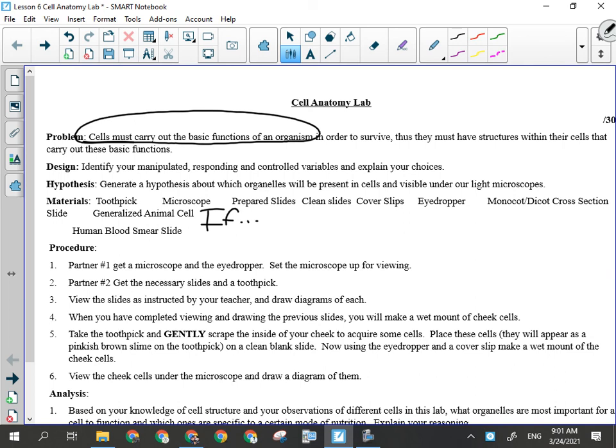Okay, and part, as always, describes the experiment. Eukaryotic cells are being viewed under a microscope at high power to discover their structures. I don't know, something. Okay, that's what we're doing. Okay, just describe the lab in brief.